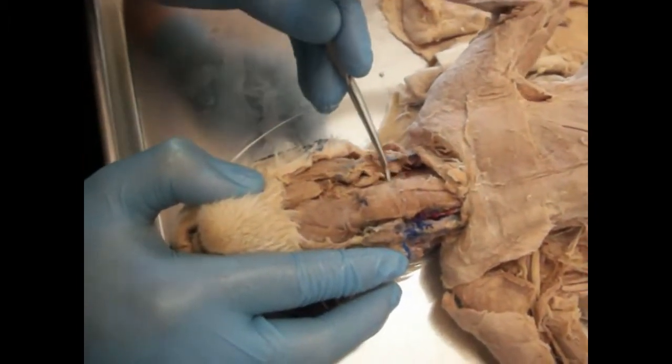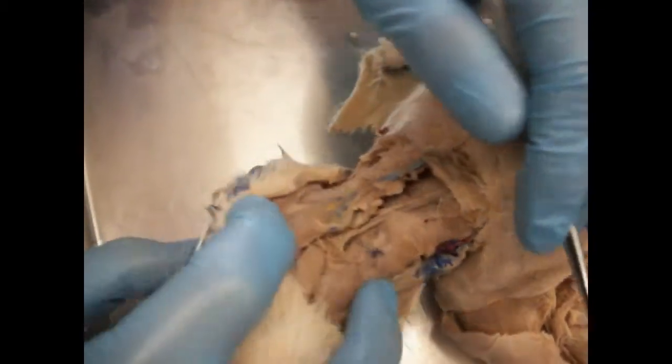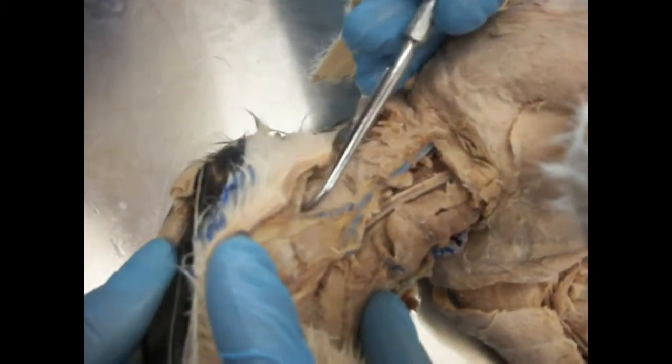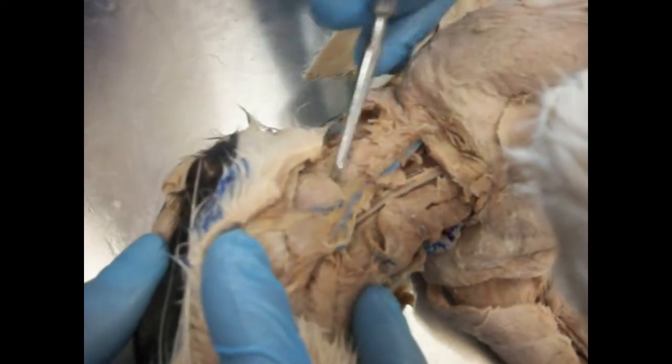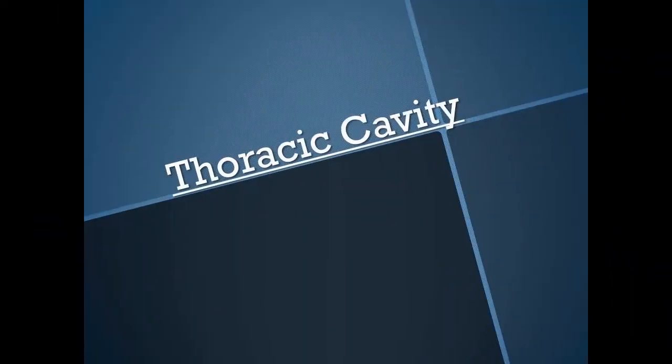And before we got to the next muscle, we had to remove a lot of connective tissue that was on the head and neck. And that muscle is the masseter. As you can see, I'm rounding its shape off. And the last muscle that I'm going to show you is the sternomastoid. Now let's move on to the thoracic cavity.